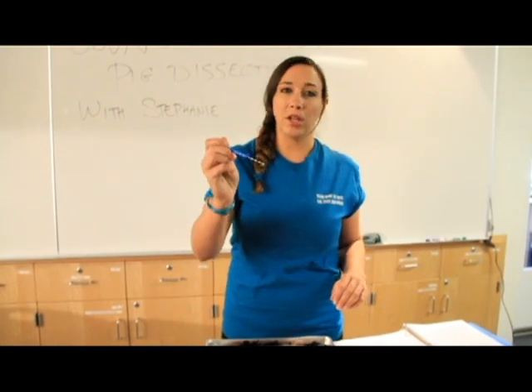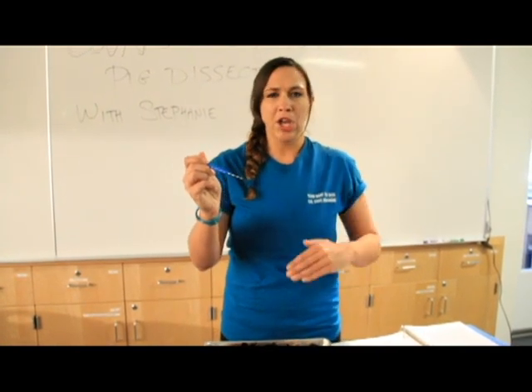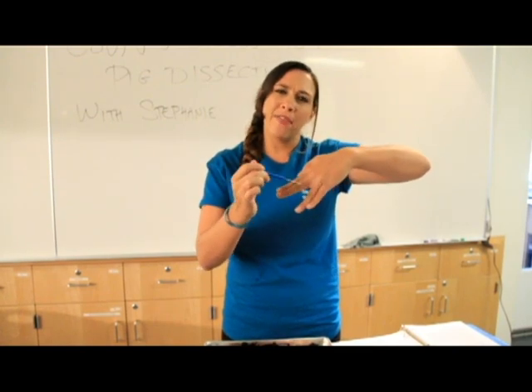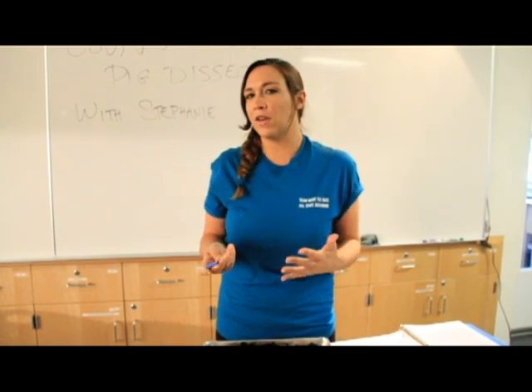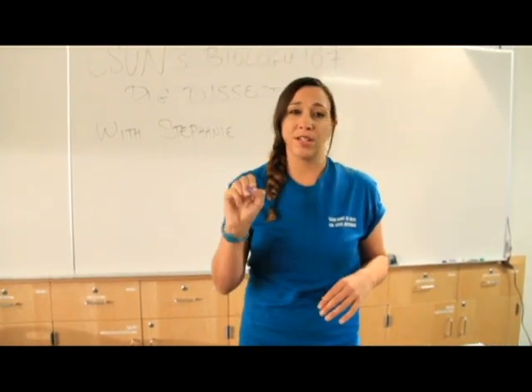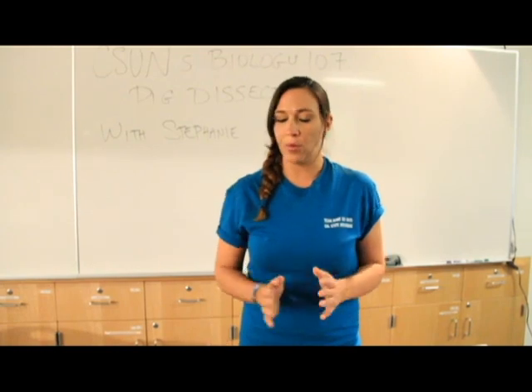These probes are really great for scraping through membrane. If you have a very thin membrane, you can just scrape at the tissue and that will break it up. Again, you don't have to use your scalpel or scissors or anything like that. This is also really great for pointing stuff out to each other because it is a nice fine point.